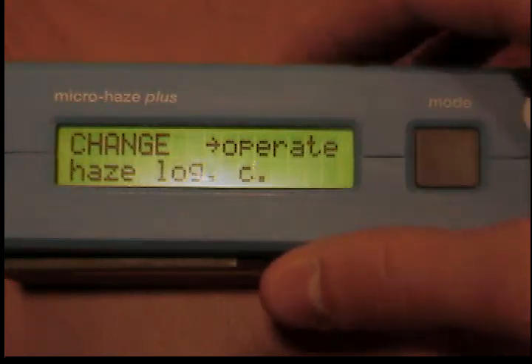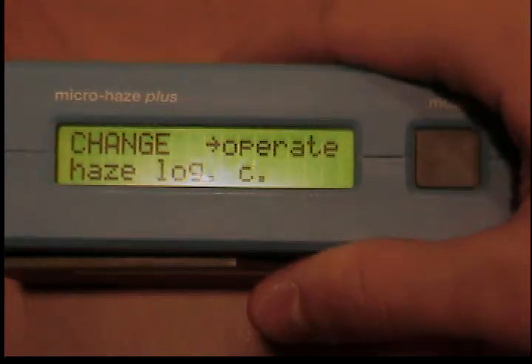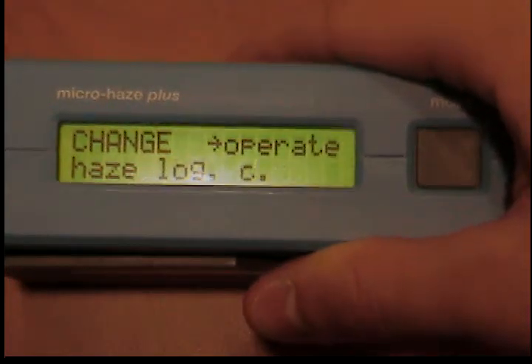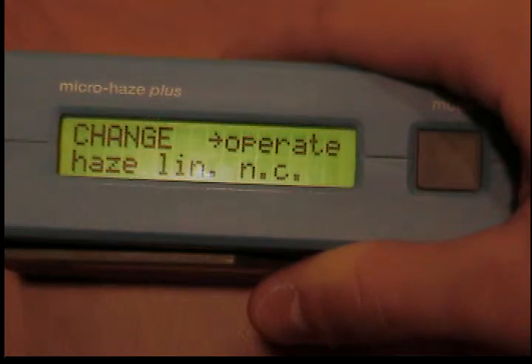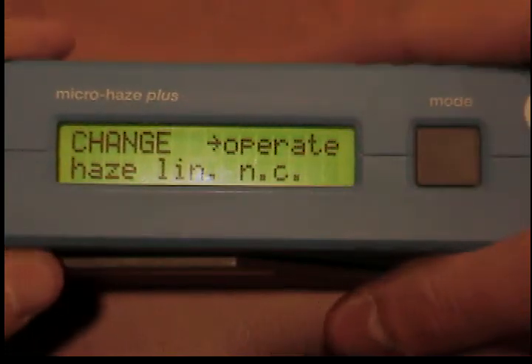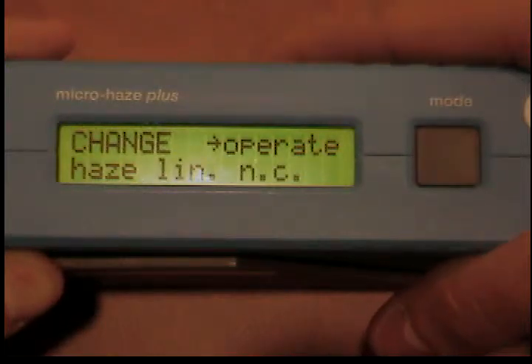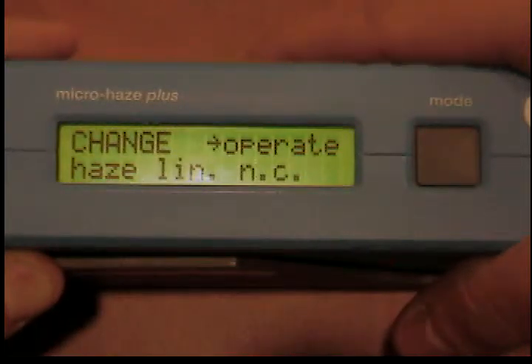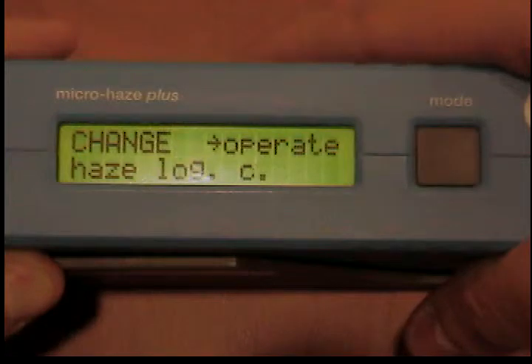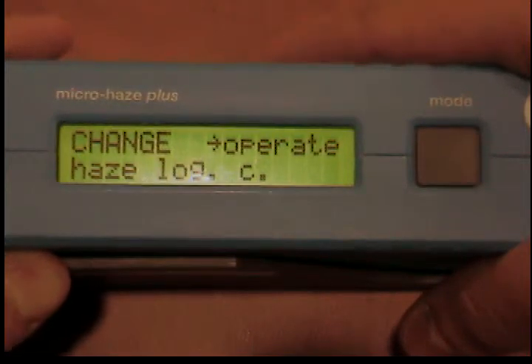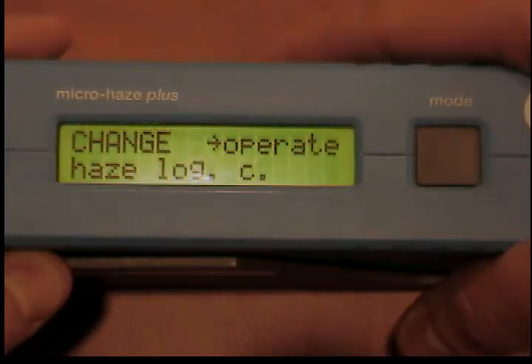The calibration data always relates to the linear haze value without brightness compensation. To change the haze scaling, push the measurement unit into the protective holder and switch the unit on by pressing the mode button. Skip the calibration and measuring routines by pressing mode repeatedly until the current set scale is shown. Change the scale by pressing operate and confirm by pressing mode.